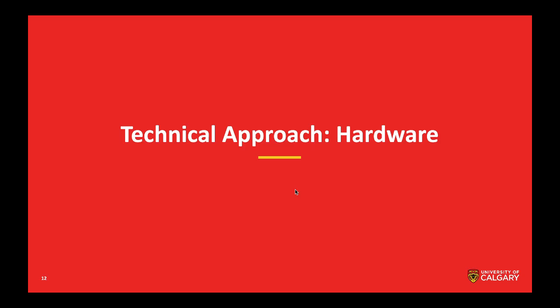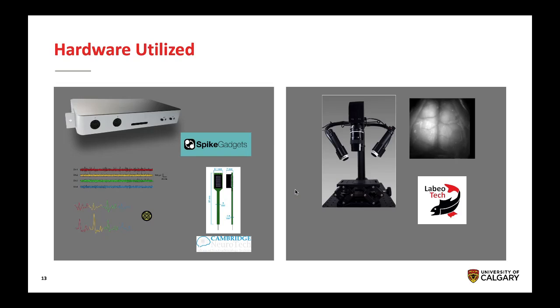This approach is meant to be hardware agnostic, but in this case we're using SpikeGadgets' electrophysiology recording system along with their excellent open source acquisition system Trodes in combination with a commercial mesoscale cortical imaging system by Labeo Technologies.